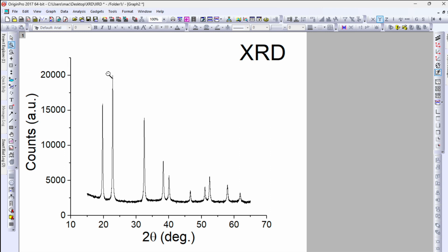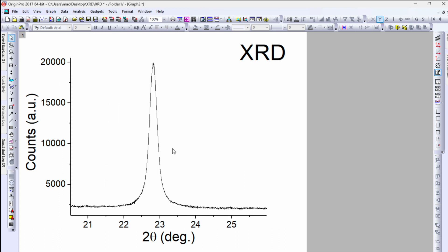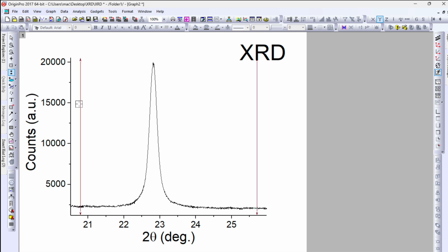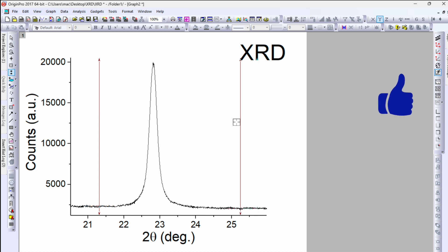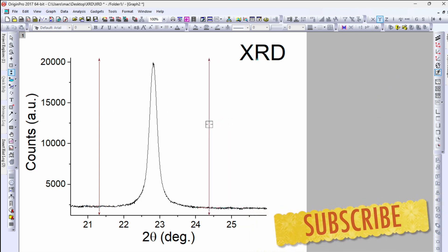Choose the peak for which you want to perform the fitting. Now we can see the peak has been selected. Go back and click on the data selector. Once you click on the data selector, you will see two vertically pointed arrows. Click on the arrow with the left button and drag it nearby the peak center to select a proper range.